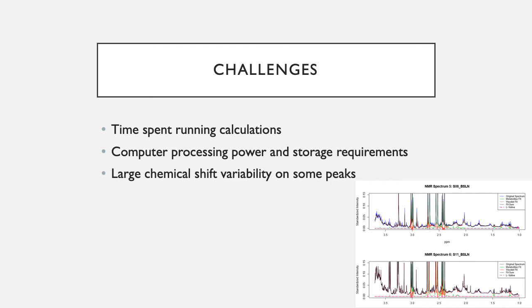While there were these challenges, Batman is still a very good software due to the capabilities and power of Bayesian statistical modeling.